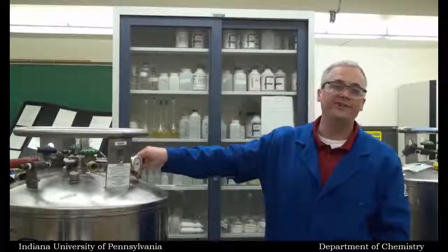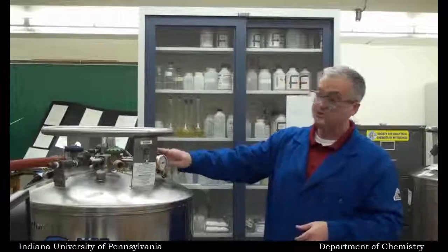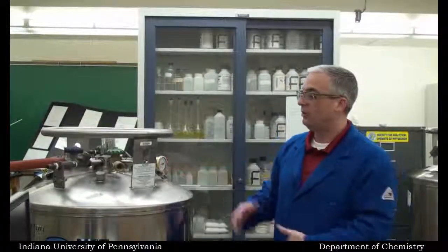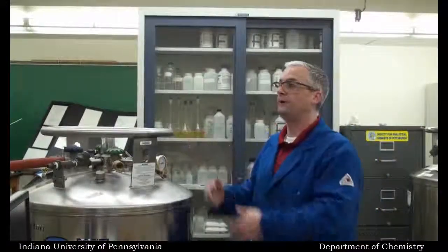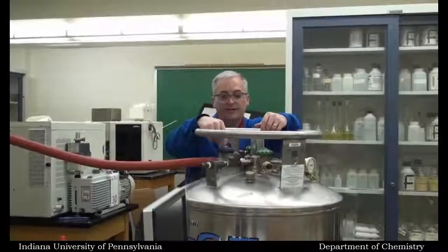Once it's here, we start venting, all right? So if you ever walk up to a Dewar and you hear the hiss, that's because it's being vented down to 50. Now, why do you want it at 50 instead of 230? Well, think about this as a valve, right? It is, and it's a pinch point.